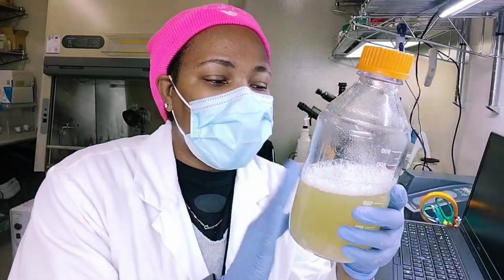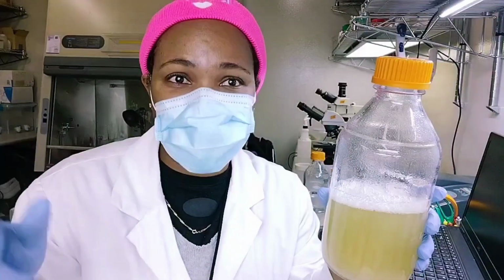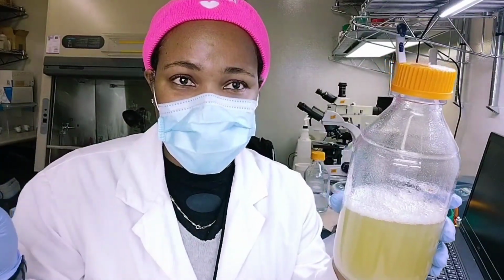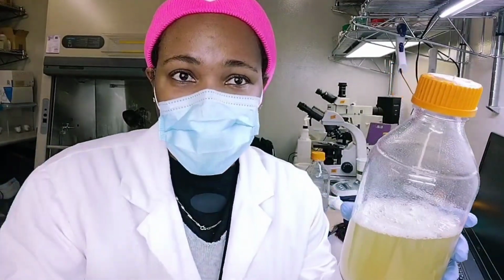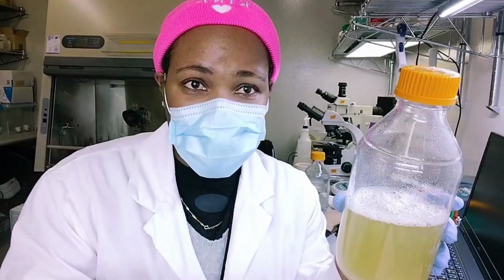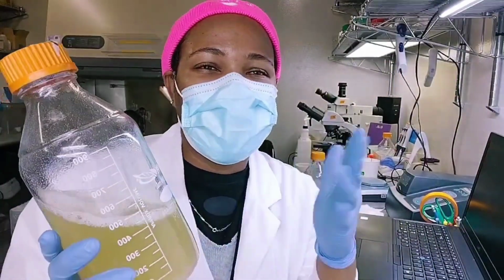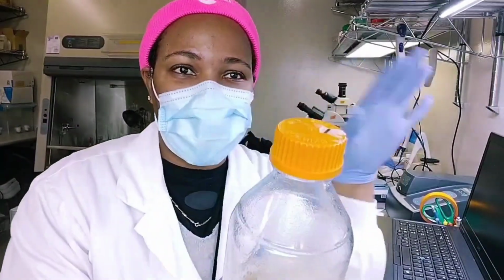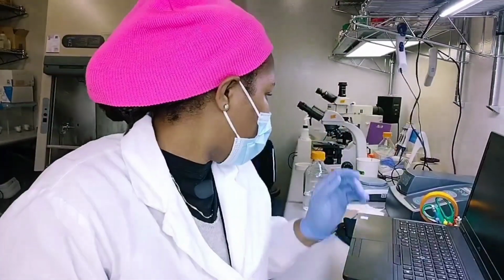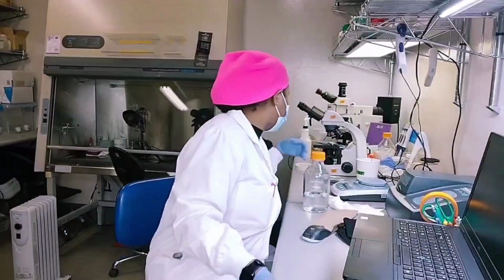Then you see the other part. But I'm not going to sterilize this right now because a technician is coming to certify the BSC, the biosafety unit that I use to keep things sterile. I don't like it when my work is disrupted, so I'll wait until that person comes in. Then I'll put this in the autoclave. It takes about an hour, maybe an hour and ten minutes. I'll do that and then go do something else. And like with everything that you sterilize, you put autoclave tape on it. So I'm going to do that.